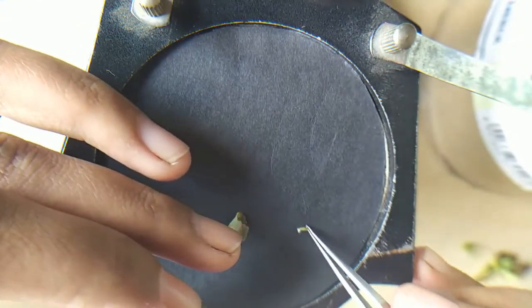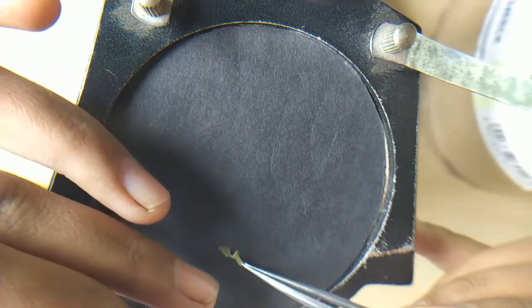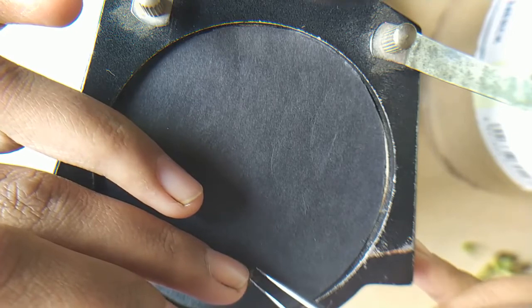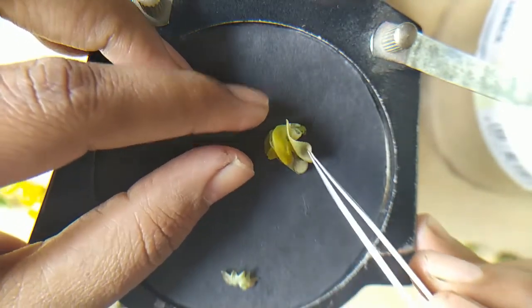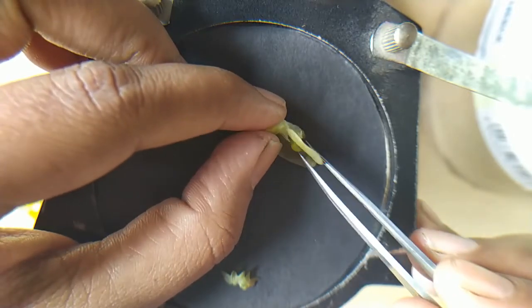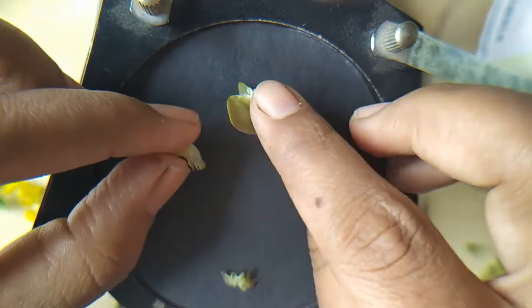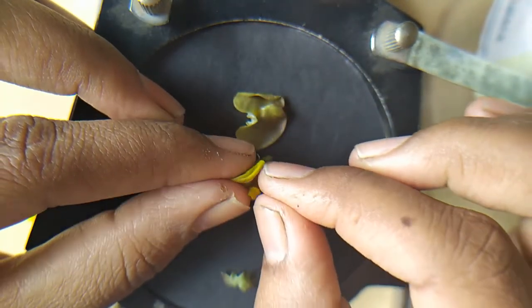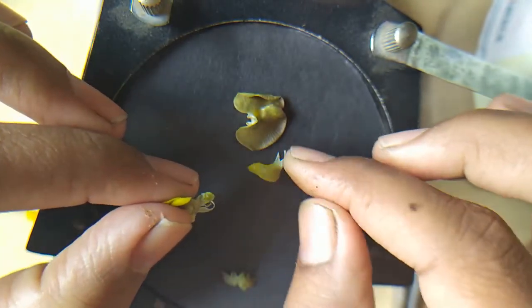This is the calyx of your green gram. Then remove the standard petal. This is the standard, then remove the wings.